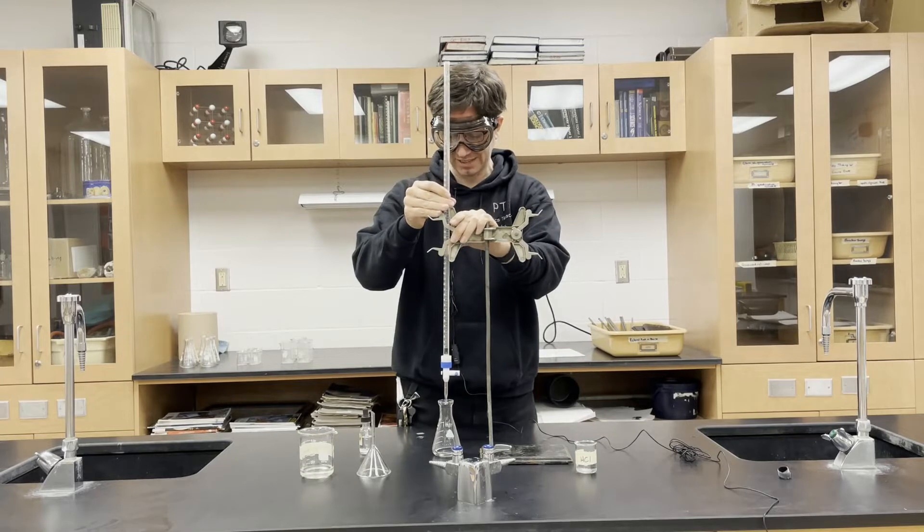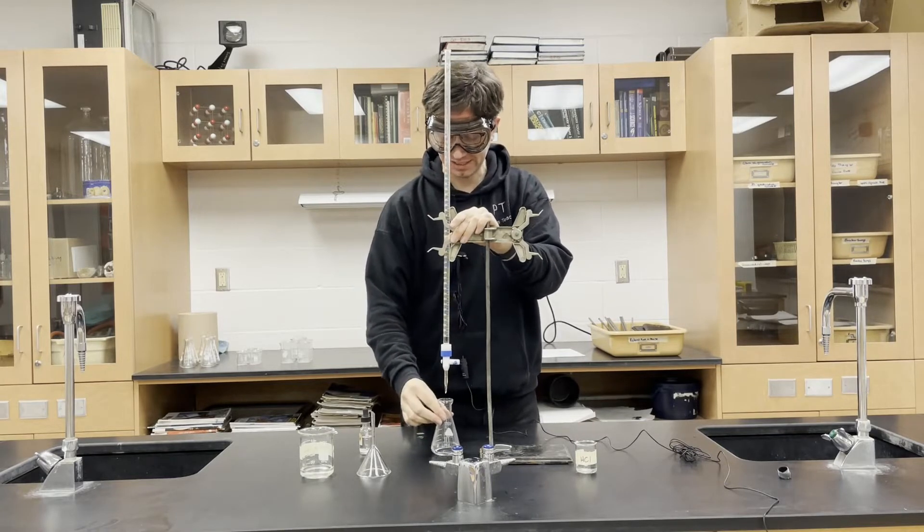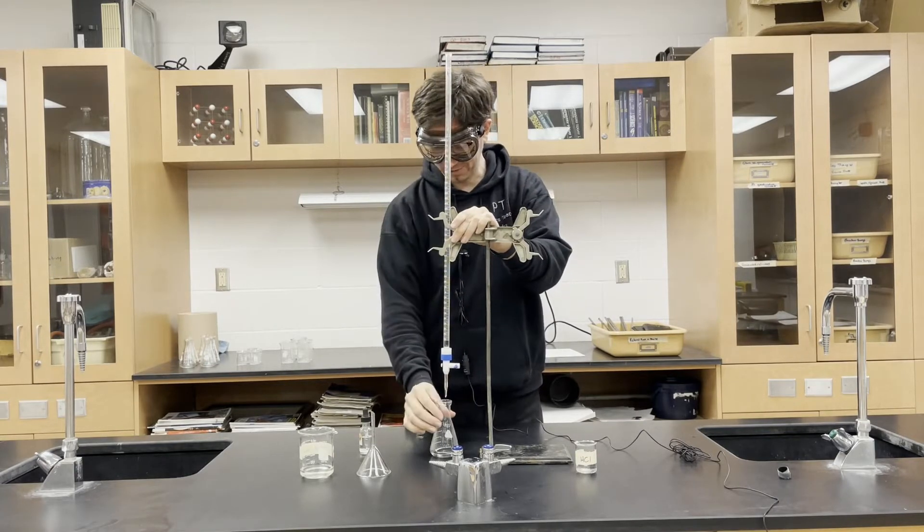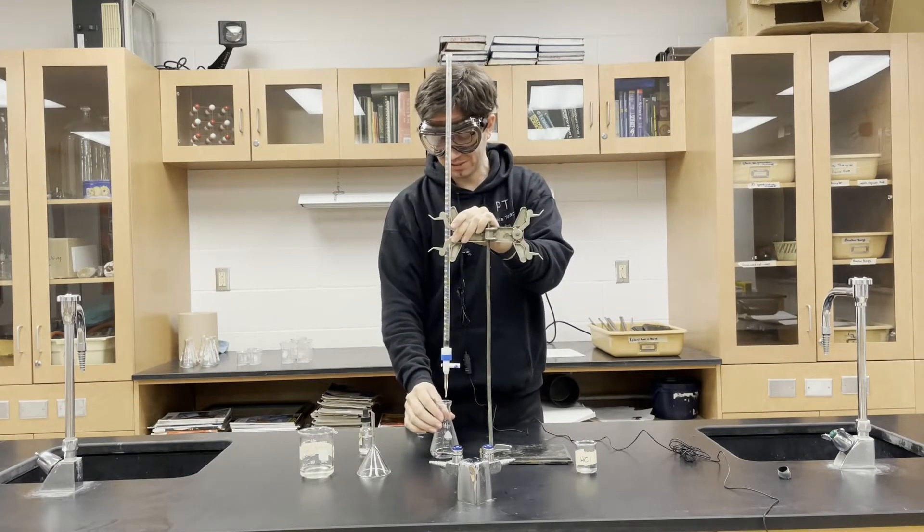Now I'll move it back up so that it is just above the flask. I don't want it in the flask because I'm going to be swirling and I don't want to chip off the end of the burette. So I want it just above but where it's not going to hit.